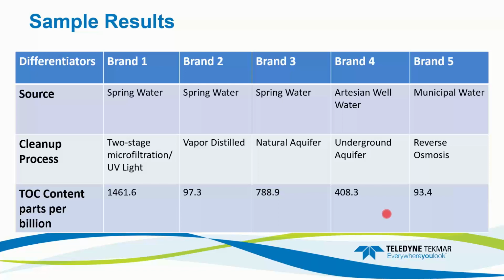So most of these samples were actually lower than the tap water. When we look at the tap water, I remember I said it's anywhere between 1 and 3 ppm. But when we start looking at this bottled water, the closest level that we got was brand 1, which is right at that 1.5 ppm level. But the other 4 brands were less than 1 ppm. So what does that mean? It plays a good clean role to prove that the water itself is pure and safe to drink.